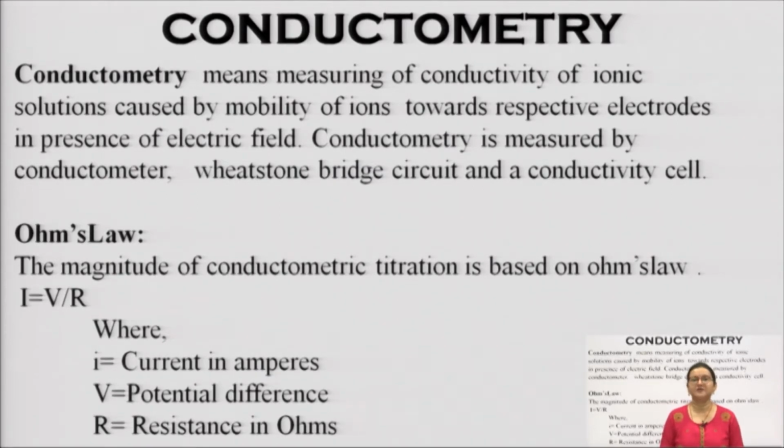That current is to be measured, and it directly relates to the electrode potential, or the voltage generated there. The voltage generated directly relates to the concentration of ions, or the number of charges of analyte, present in the given sample solution, which is our test solution. So, how do we do that?